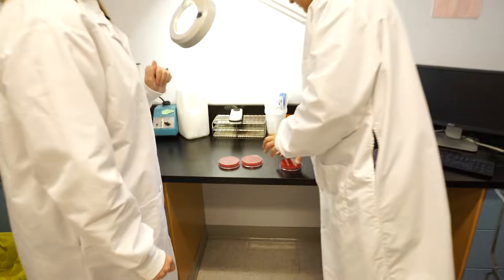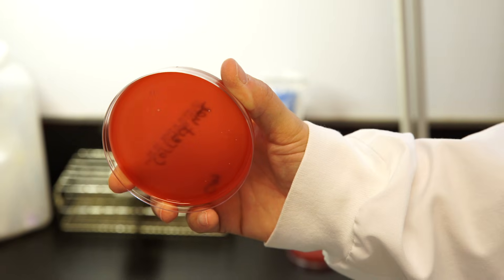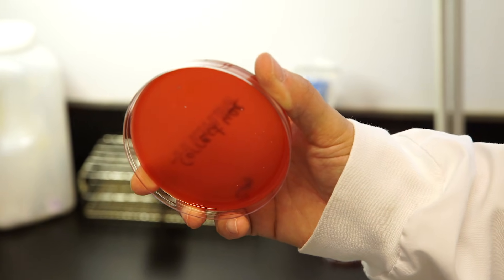With proper hand washing we have almost no bacteria — still a few white dots, but these are just skin organisms. Skin is a nice environment for bacteria: it's moist, warm, and has nutrients from the proteins in the skin. When you wash your hands, the soap helps kill bacteria, the physical rubbing and friction wipes some off and damages them, and drying your hands properly removes even more — so you get a lot more benefit if you wash and dry fully.